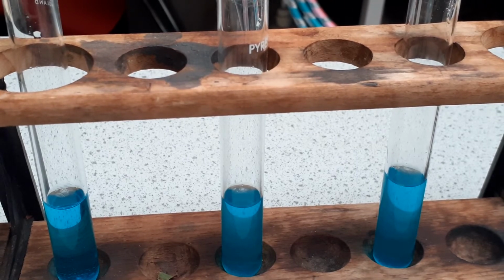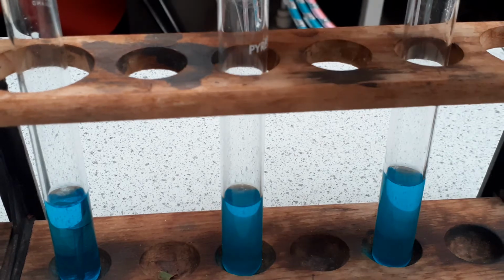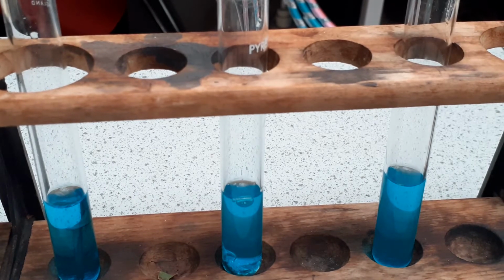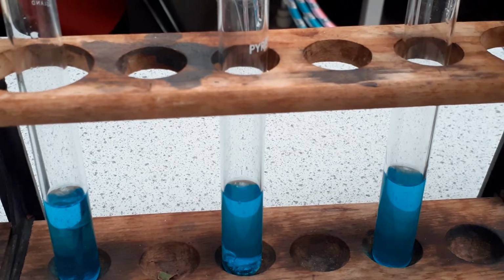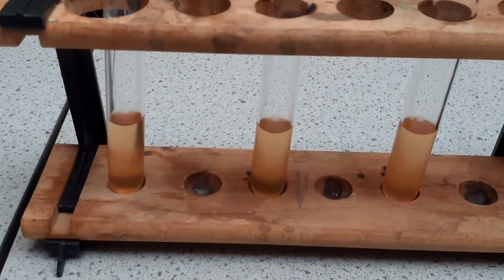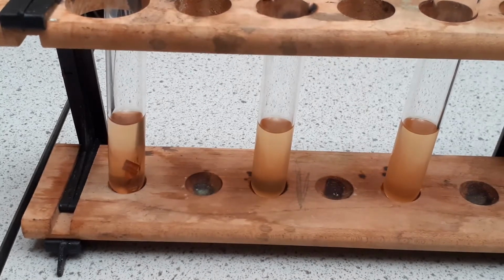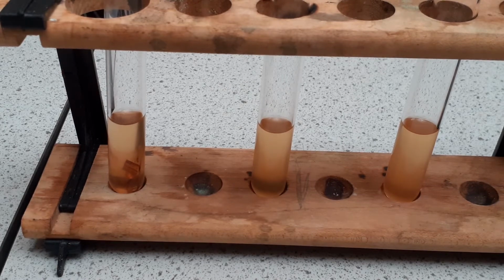I'm going to add to 1 test tube iron, and we'll look for a reaction. To the next one, I'm going to add a piece of zinc. To the next one, I'm going to add a piece of magnesium, like so. Then, if I move on to the iron sulfate, to that, I'm first of all going to add a piece of copper. To the next one, I'm going to add a piece of zinc. To the last one, I'm going to add a piece of magnesium.